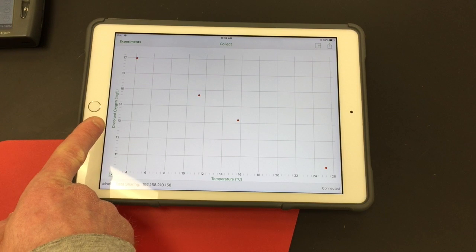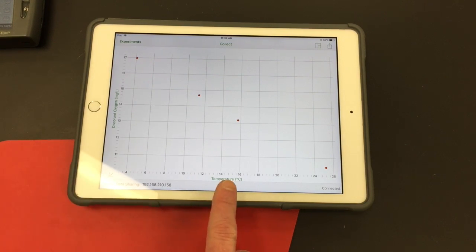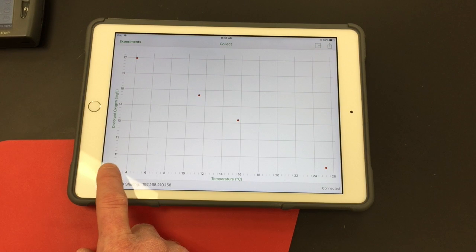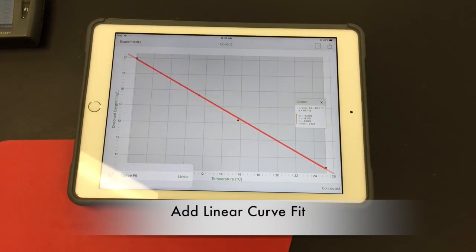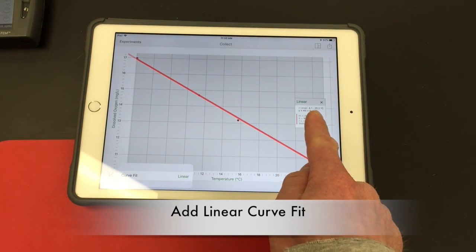Okay, so now I have dissolved oxygen on the y and temperature on the x. And then I'm going to add a curve fit. So I'm going to go into the bottom left, apply curve fit. It's going to be a linear curve fit. So I get my y equals mx plus b.